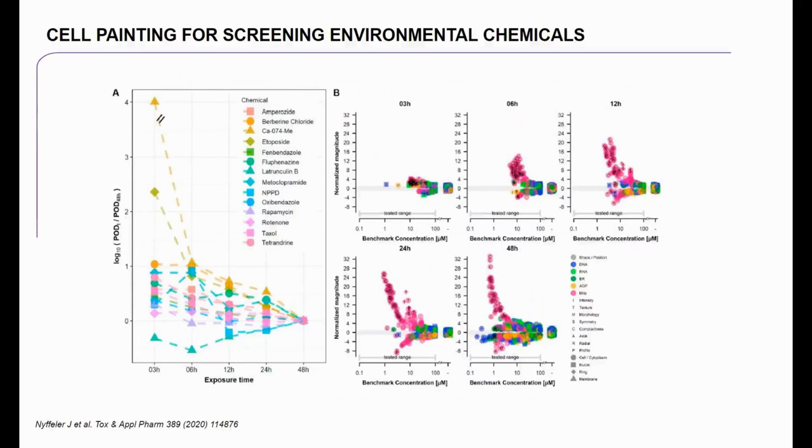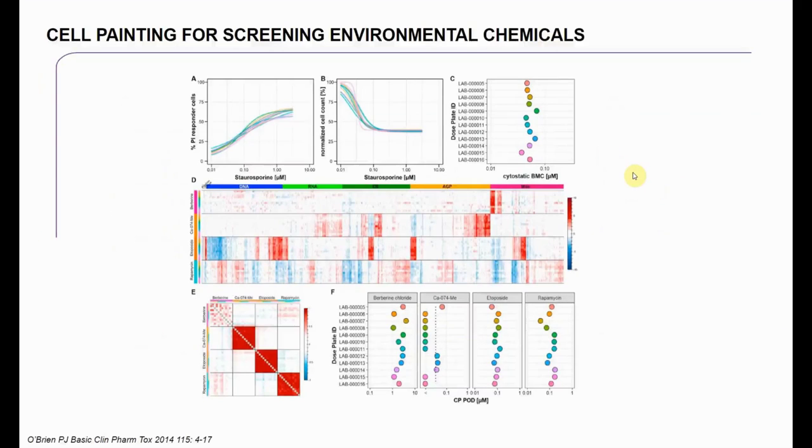And so you can see here that with a lot of these compounds, you don't get any response at 3 hours, but then here with this compound, you start to see a response at 6 hours, 12 hours, and then it maxes out at 48 hours. So the general protocol seems to be that it's a good idea to pre-incubate again for 12 hours.